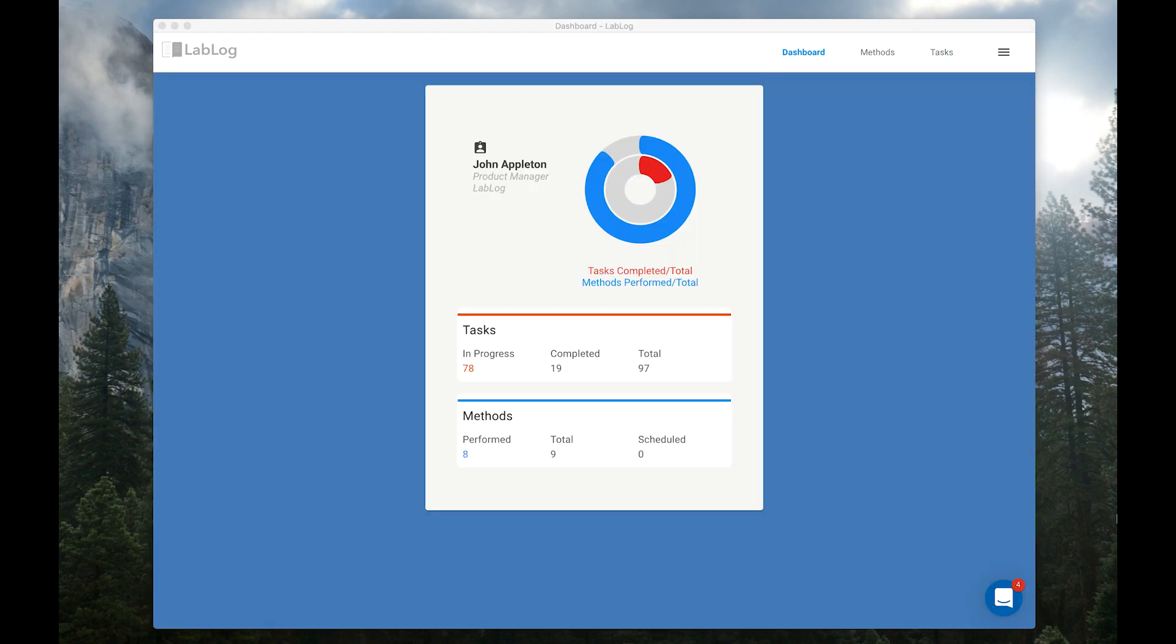Now about tracking lab progress that I mentioned earlier. You can see your stats on the dashboard. And if you're a project manager, you can view your team's progress too.